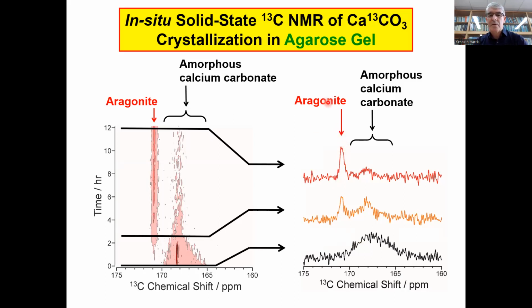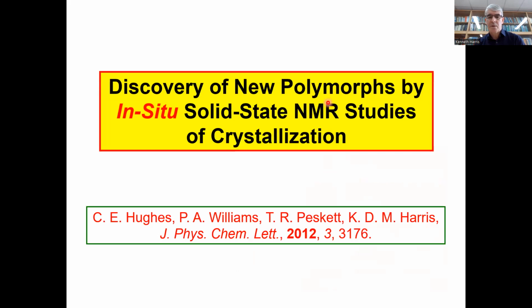So again, very clear information on the evolution of the different polymorphic forms during crystallization, and also with the intervention of an amorphous phase in that particular case.